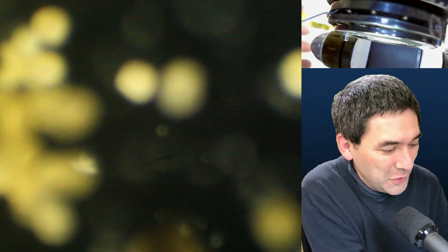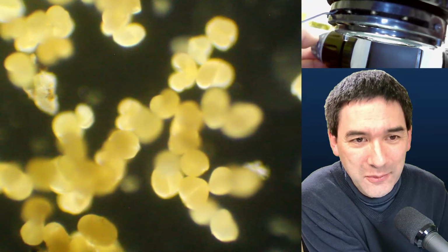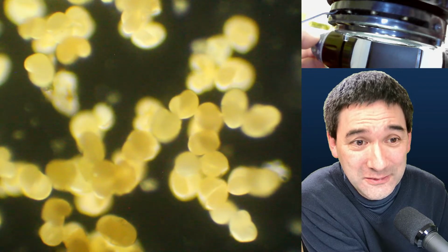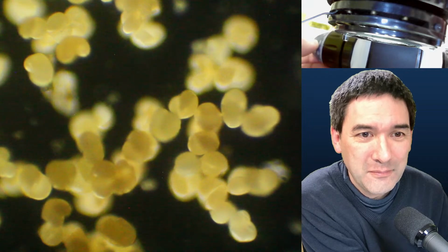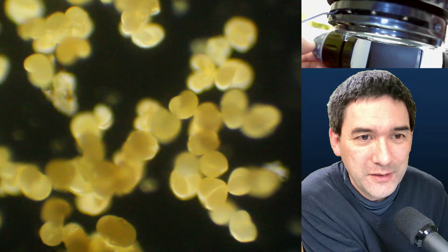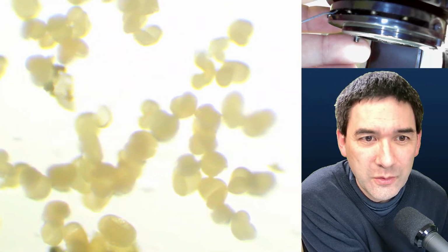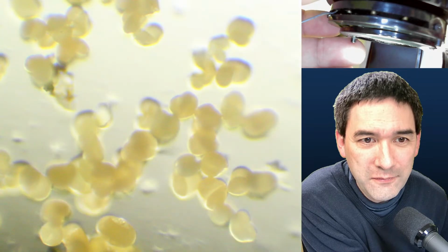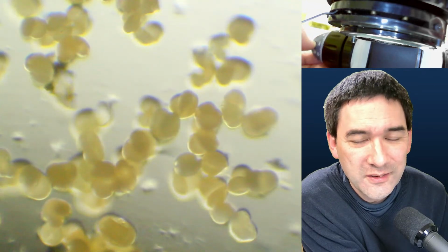Now the dry mount. So the bottom line is, there is probably not one single perfect solution here. That is the dry mount, basically surrounded by air. That's how it looks here. Let's turn it down a little bit. Because the pollen are stacked on top of each other, it's more difficult to focus. Let's open it again and see if we can get somewhat of an oblique effect here. Not quite as nice.